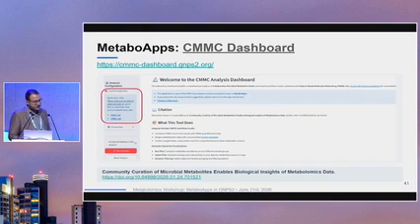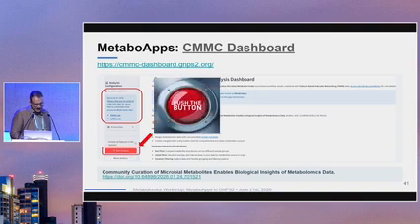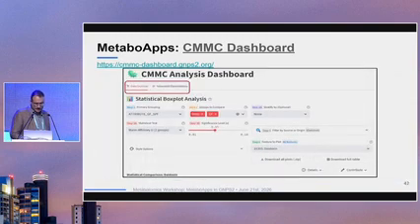So as I mentioned, for the example data, you need to see, and this is already on the website for the ones that haven't accessed it yet. I mention it as examples, but that's exactly what you can do on the website. And for the CMMC, as I mentioned, you need to have the FBmn, so the regular molecular network job, but then you also need to have the enrichment ID, so that's the CMMC job. You run the analysis, and that's the type of information you're going to visualize.